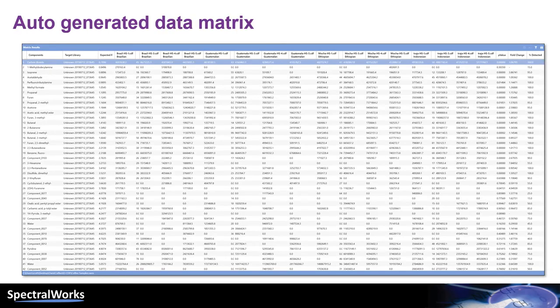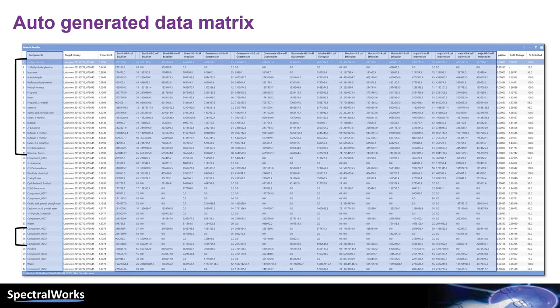Once the sequence has processed, we switch to the matrix results view, where the matrix is automatically generated for us. Here we can see the component name for the NIST search or the created component if it wasn't found in the NIST library or it failed to meet our search parameters. Here we also report the areas for each of the components in the data files.